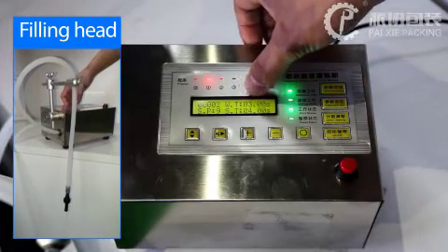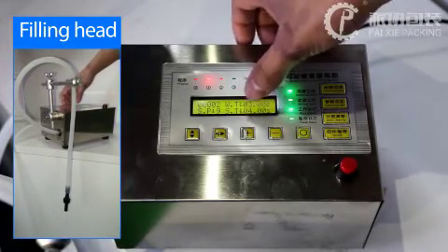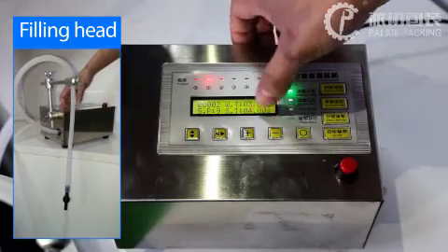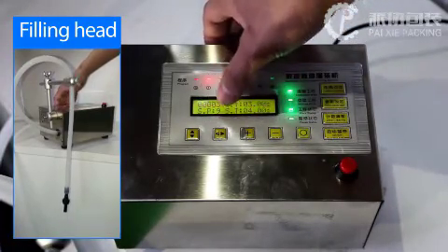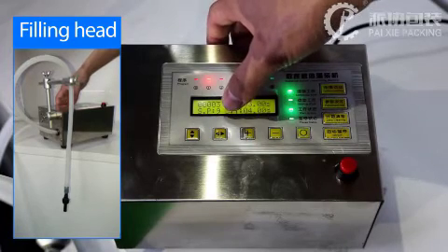You can see the feeding time, three seconds. The interval time is five seconds. And the feeding speed is nine. Nine is the maximum number.